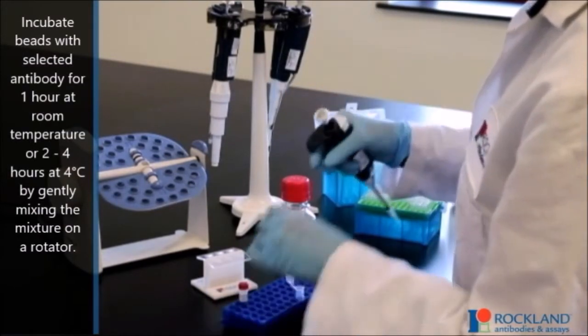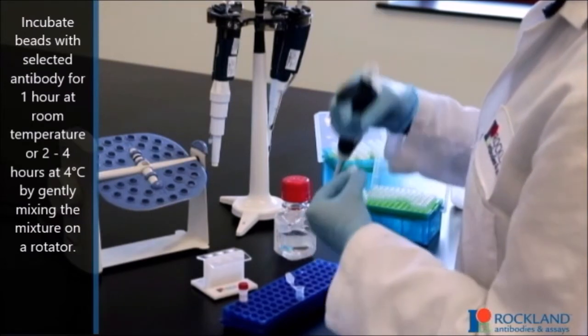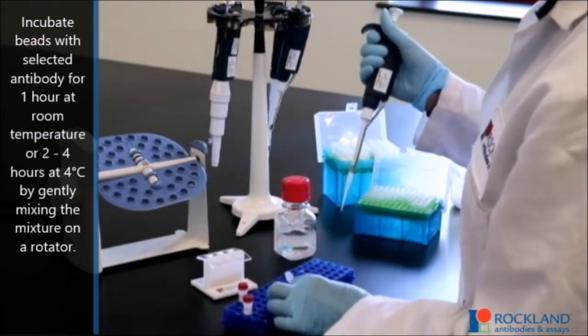Incubate beads with selective antibody for one hour at room temperature or two to four hours at four degrees Celsius, by gently mixing the mixture on a rotator.